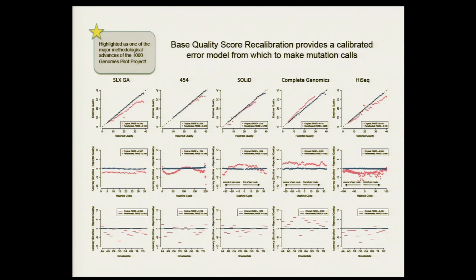Ryan, systematic bias is caught by dbSNP. Sorry, what? Systematic bias is caught by dbSNP, right? If you have differences in the reference, they appear as variation, high-frequency variation. They're captured as SNPs, so they can be filtered out here. Sure. Things that are identified as genetic variation in the population would be discounted in this procedure, because you're skipping all dbSNP sites, for example. Yeah, but maybe the difference is based primarily in the same sequence. It doesn't matter, right? The only issue is, are there errors? Are there mismatches in the reference? If the reference is wrong, every sample is a mismatch. No, I'm saying that dbSNP was also based on, for example, Sanger, which has exactly the same systematic error. Then you're not going to find a mismatch.